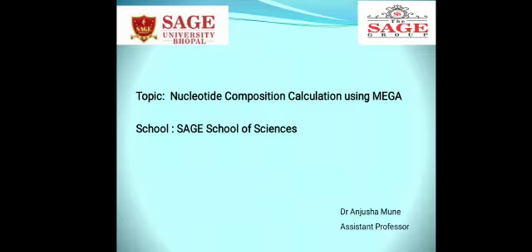And the topic of this video tutorial is nucleotide composition calculation using MEGA.